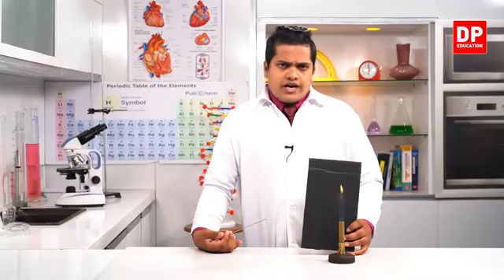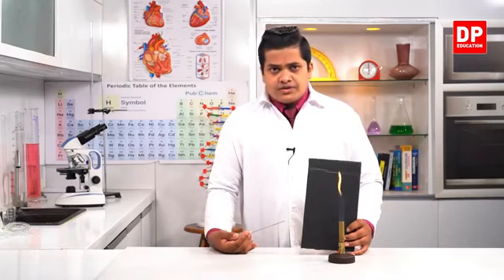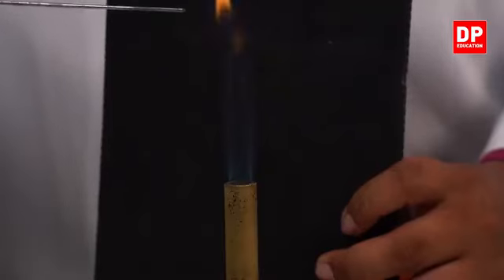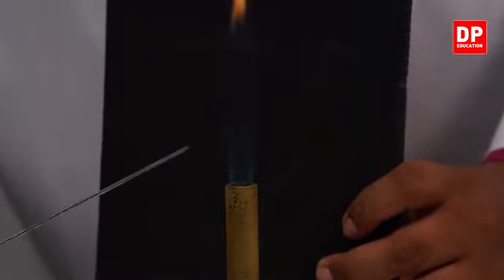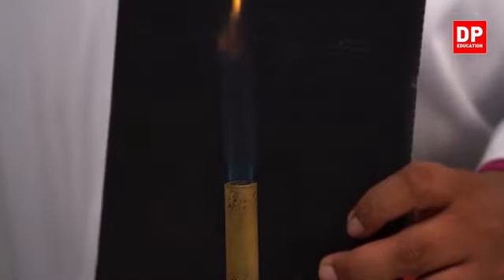Unlike the candle flame, the Bunsen flame is up to 99% blue in color. Here you can observe a small bit of yellow color at the end of the Bunsen flame, but most of the areas are blue. So at the outermost zone, you can observe the invisible zone.